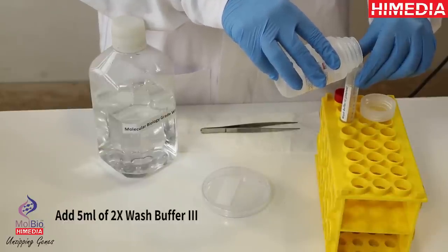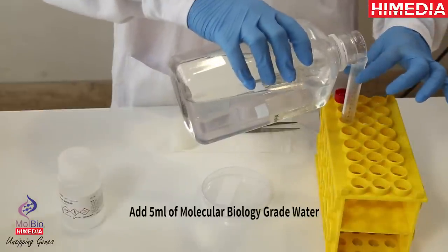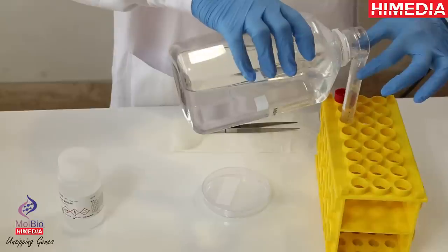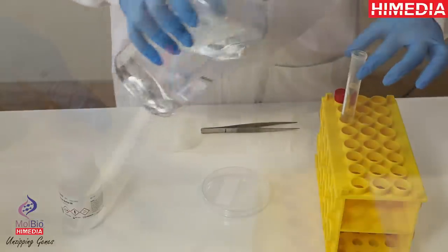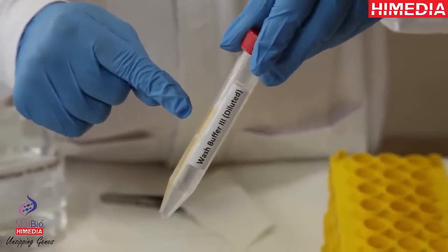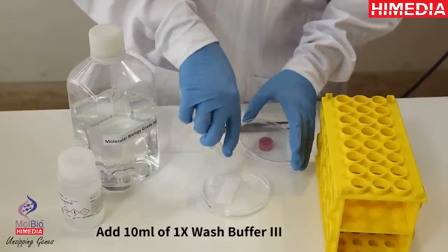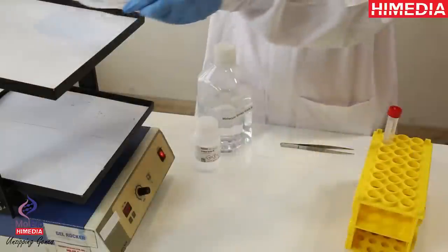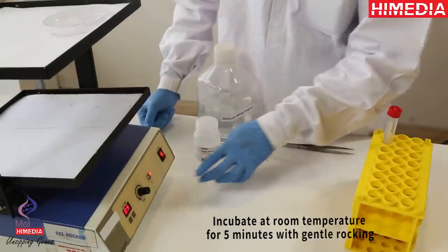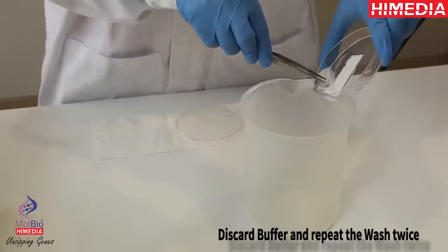Add 5 ml of 2X wash buffer 3. Add 5 ml of molecular biology grade water. 10 ml of 1X wash buffer 3. Incubate at room temperature for 5 minutes with gentle rocking. Discard buffer and repeat the wash twice.